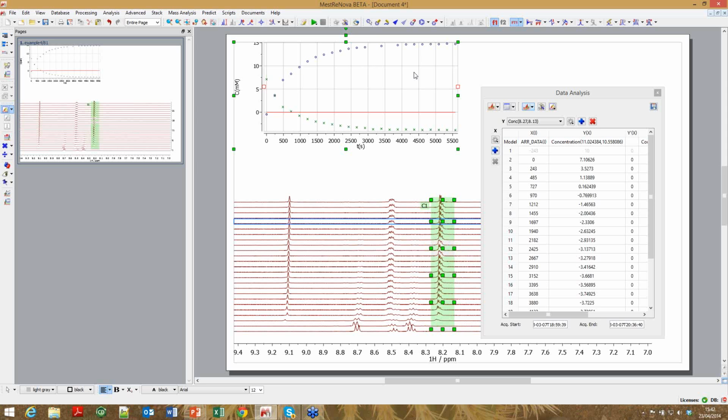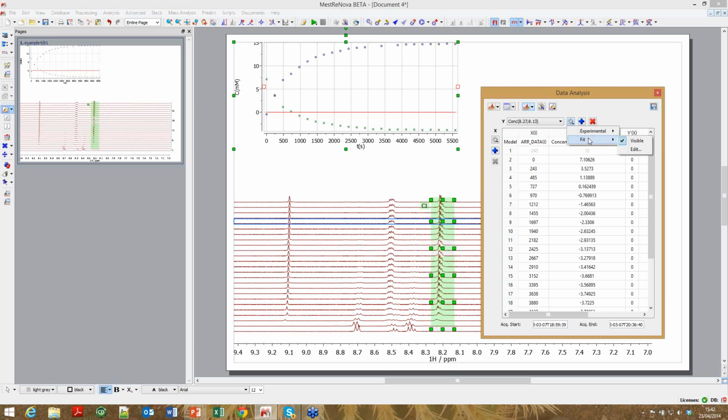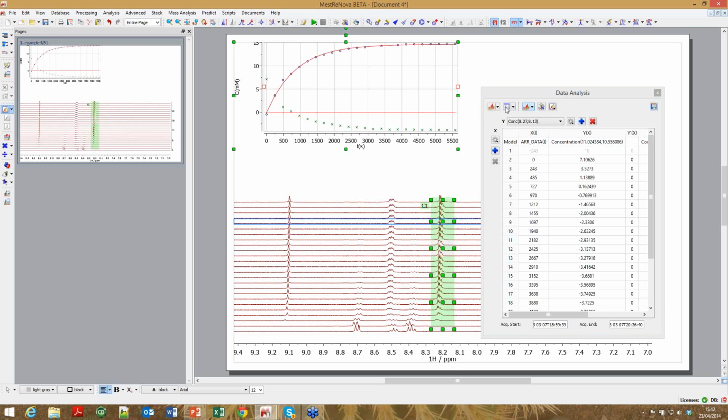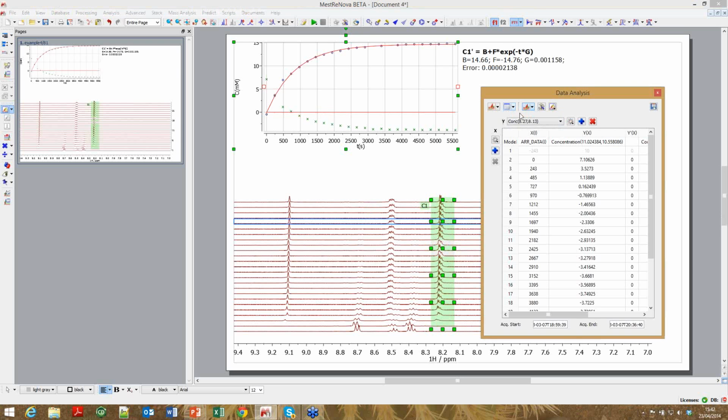So for the particular reaction spectrum vector that has that crossover point, you'll find that there's a much bigger integral value for that, and you want to delete it. So you can delete it in exactly that way. You just right-click on it and delete that point. And when you do that, the whole calculation business gets updated for you. So this, I'm referring to the fit. Okay, and let's report that. There we go.